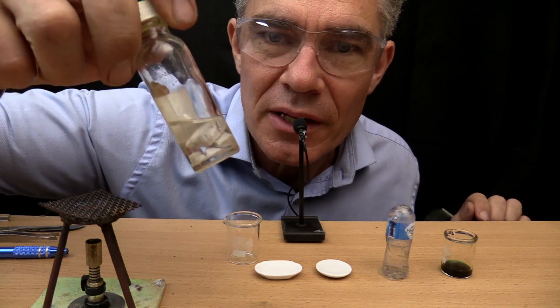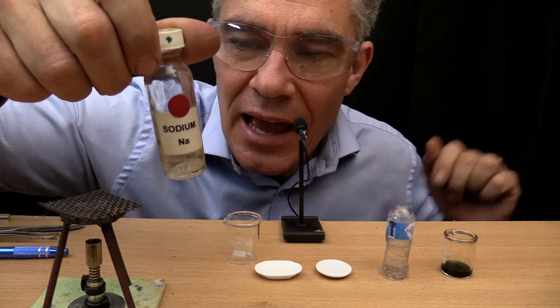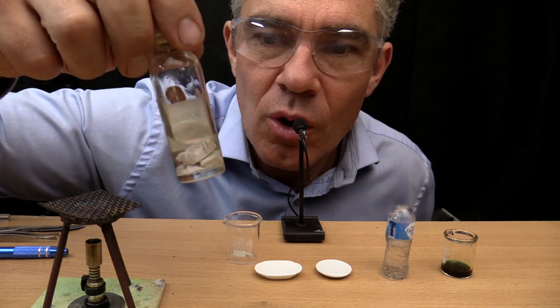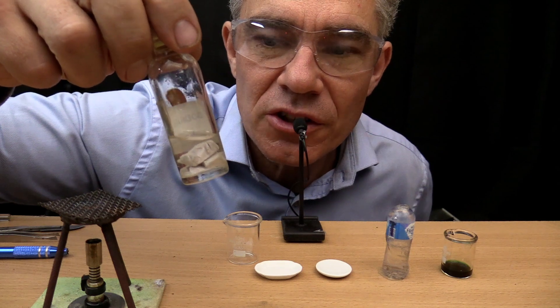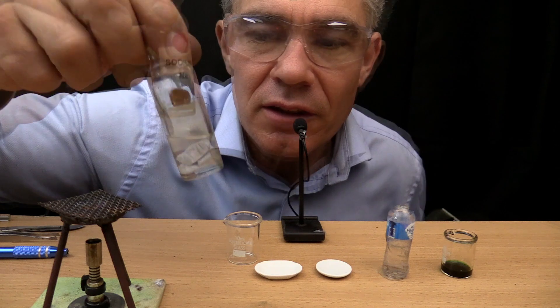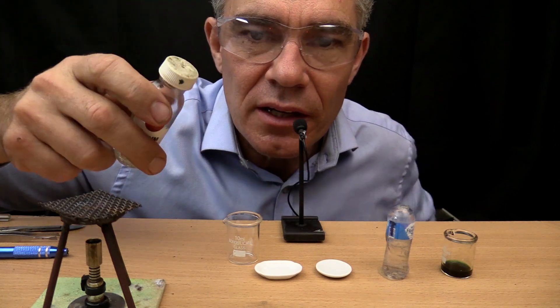Sodium is a metal and it's so dangerous it has to be kept under oil. This is not water — this is oil, and the oil stops the oxygen from getting to it and oxidizing it. I'm going to tip this out into this little beaker.